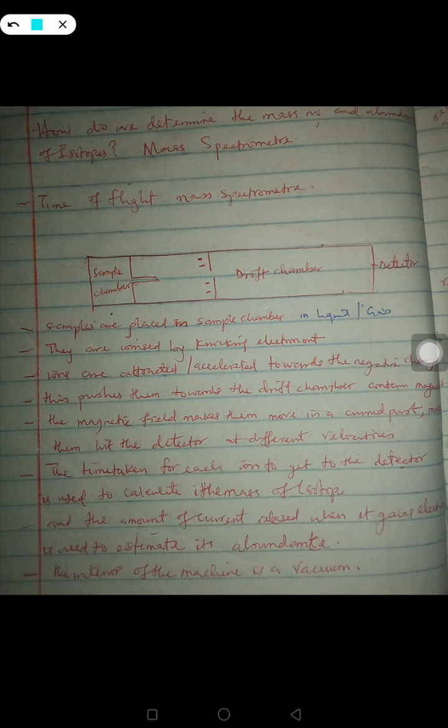Because it has become an ion, it will become either positively charged or negatively charged. It's very important to understand that. But I already told you that in this case we are knocking out an electron, so it is losing an electron. It's going to become positively charged.